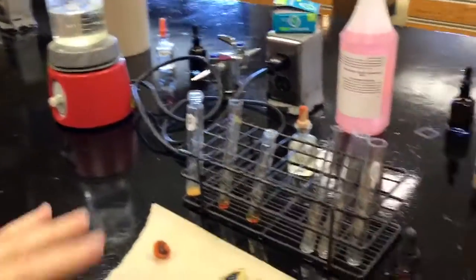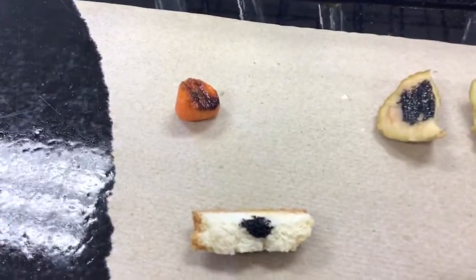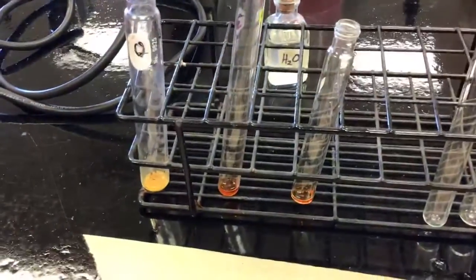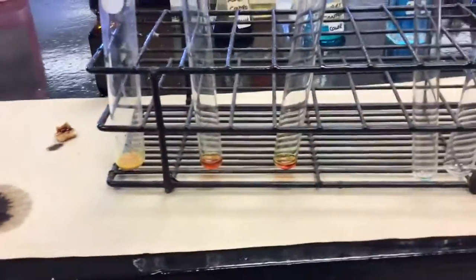So write the results down that you see. The apple is a little bit more convincing now. The carrots is a little bit more convincing now. And put your interpretation. Is there or is there not starch according to the tests? Here, I'll put that against the lighter background. Got the milk, the regular soda, and the diet soda.